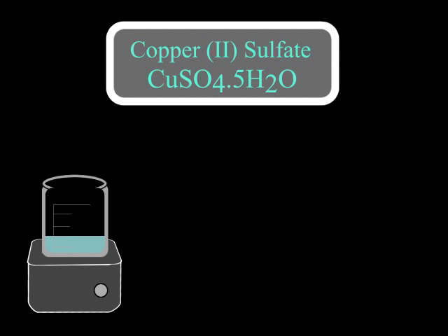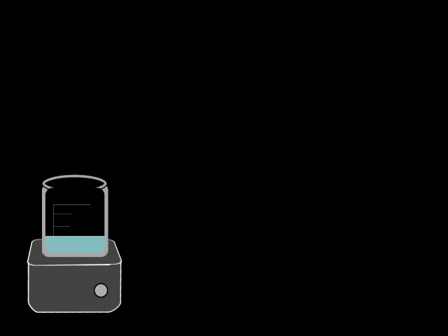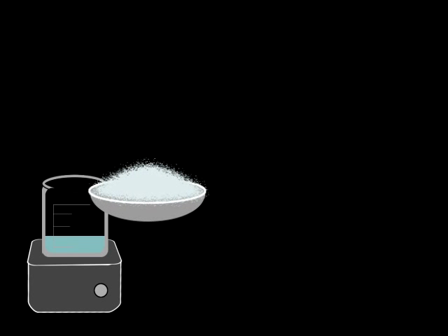Copper sulfate exists as a pentahydrate, so 90 grams of the copper sulfate is water, so to figure out yield we need to take that into account. Next we take the sample of sodium carbonate and slowly add it to the copper sulfate solution. The copper carbonate salt that follows will completely precipitate out of solution, as copper carbonate is completely insoluble in water.